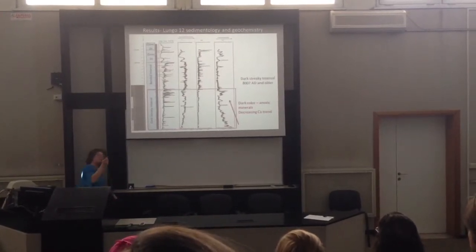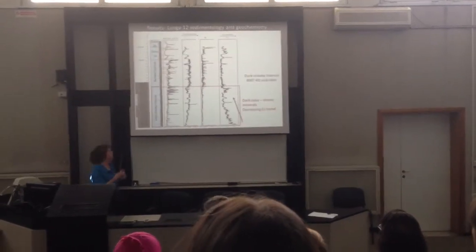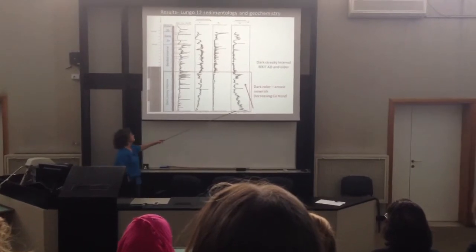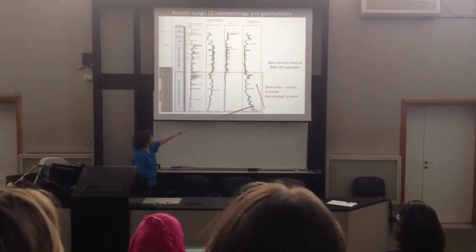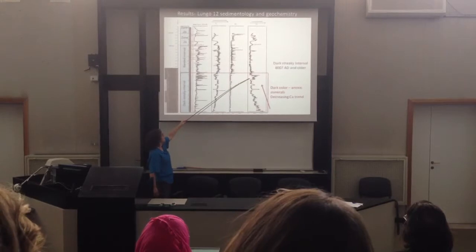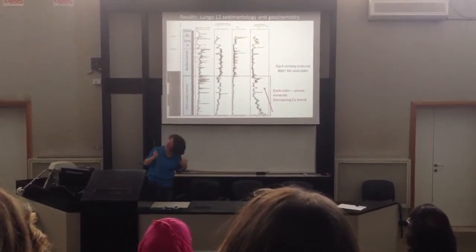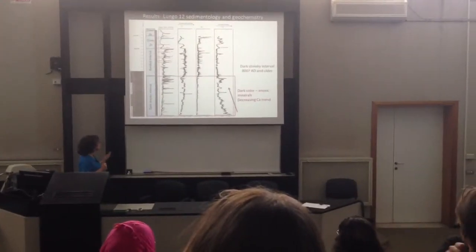The sediment is dark. It has some olive and black coloration to it. If you look at the chemistry, there's an interesting trend in the calcium where it's higher here, and then it decreases. Then there are some periodic spikes in here. So it's going to be interesting to try and interpret what exactly this calcium signature means.